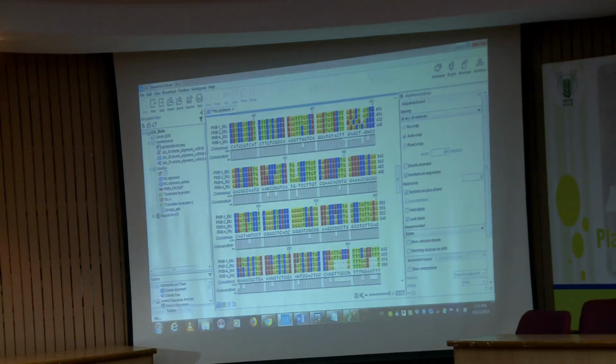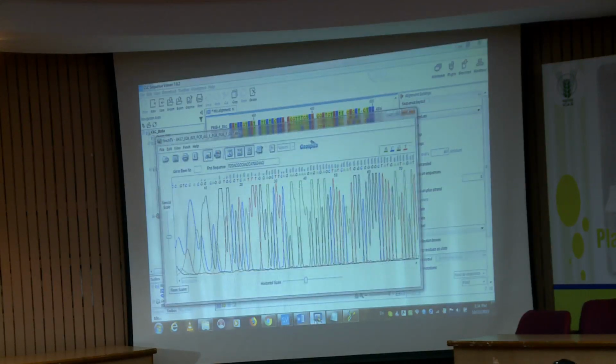This is sample 1, 2, and this is K and A. You just select the sequence, right? By right click you can copy it, go to FinchTV. Actually this is some other file, so it may not highlight over here. So paste it over there, then say enter. Okay, pattern not found because this is something else.